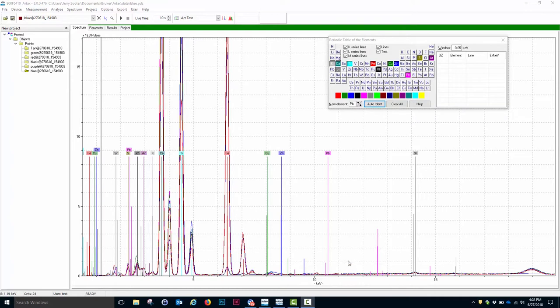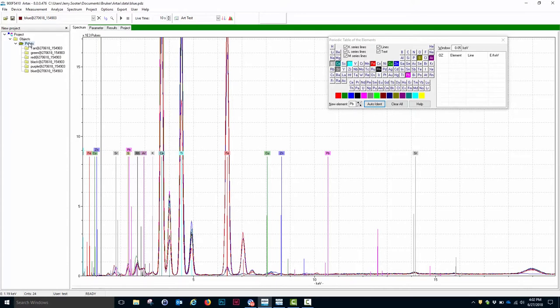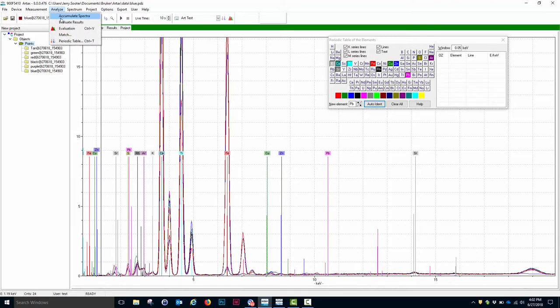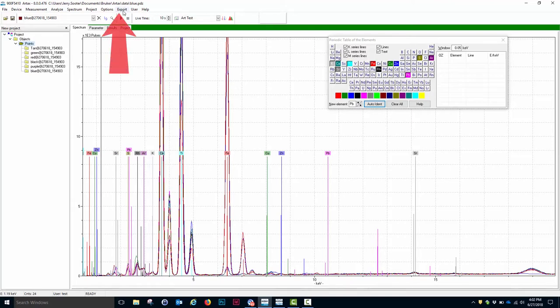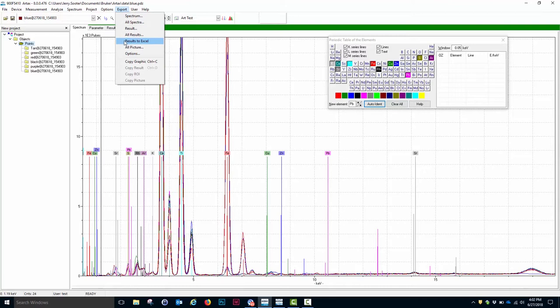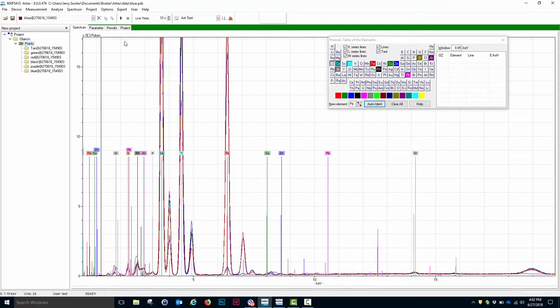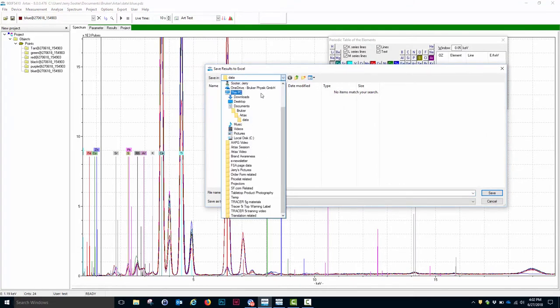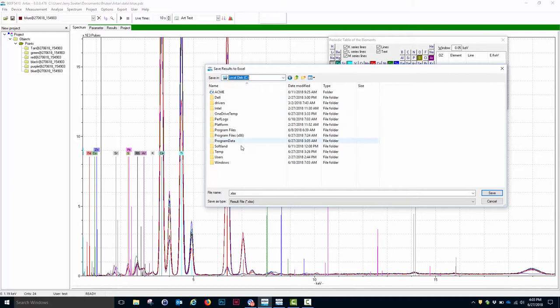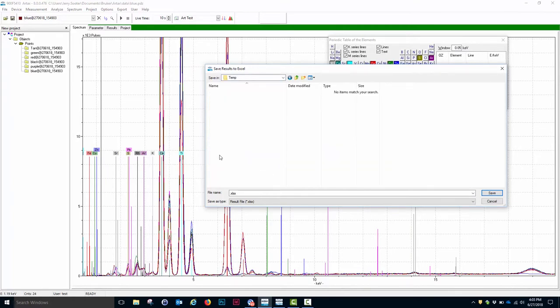The last thing we want to do with this dataset is output the data to an Excel file. To do that, we need to select the node we're interested in, in this case, Points. Then we go to the menu item Analyze and select Evaluate Results. This generates the net intensity for each of the identified elements in each of the spectra, which are contained in that node. With this node still selected, I now want to select Export and select Results to XL. And I click that item. I will be asked to save the data. And I want to make sure I go back and select my temporary file. And I will call this Art Test.